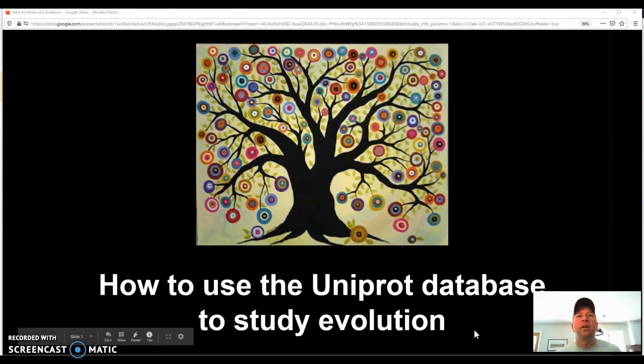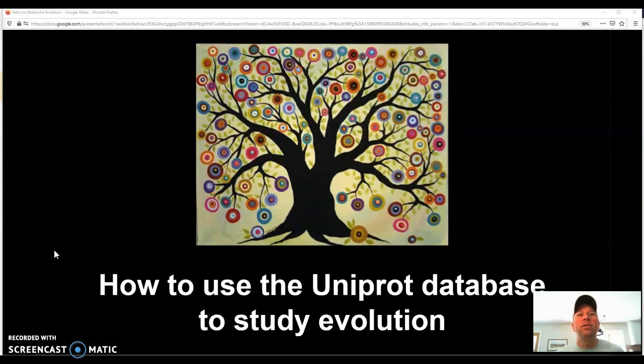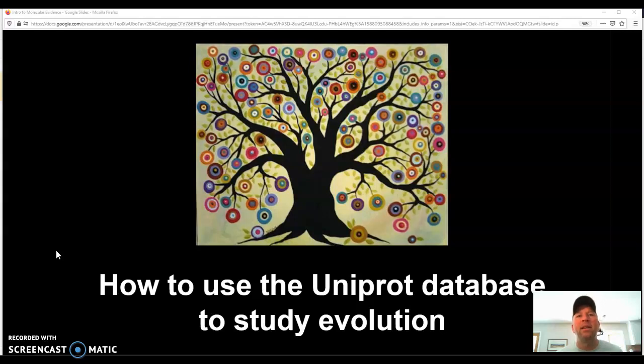Hi, welcome to this introduction to how to use the Uniprot database to study evolutionary relationships and create phylogenetic trees. We can use a database of genetic information to understand the relationships between species, and in this case we'll be looking at the relationship between bats and birds and mammals.